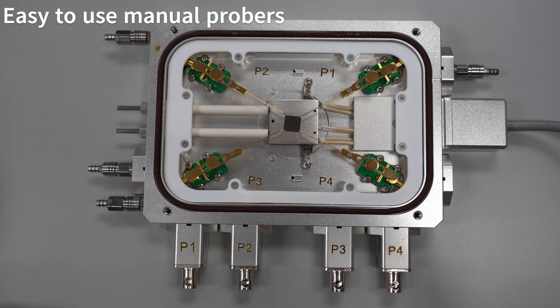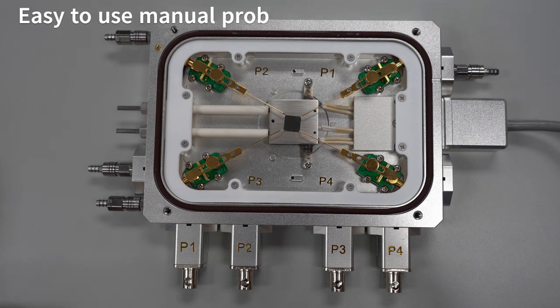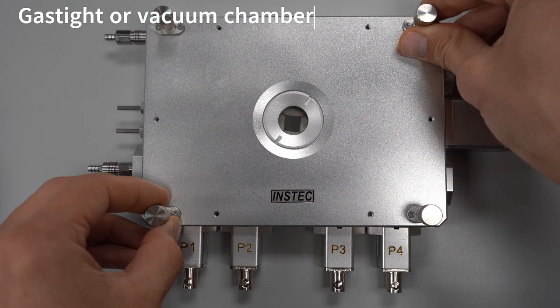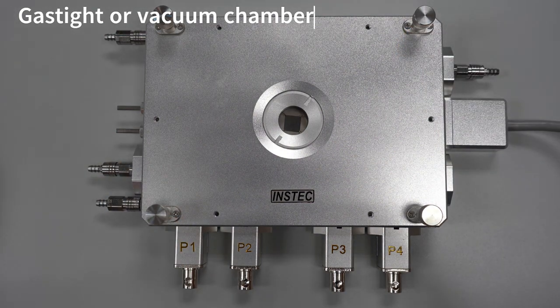just as in the previous model. And then, of course, you can put on the lid to perform your temperature control, environmental control, or place it underneath some optical system as needed.